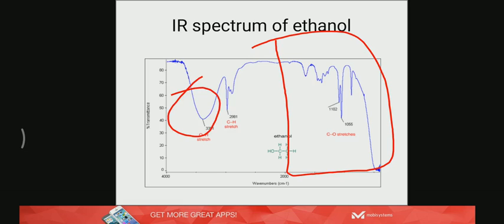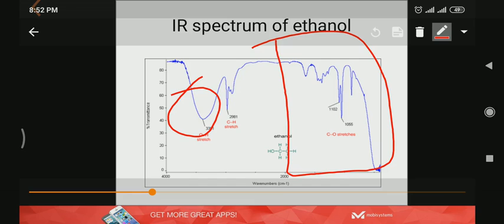So if you take ethanol and methanol and compare, the IR spectra of both molecules will be very similar outside this fingerprint region, but the fingerprint will be very different, or unique. You can easily distinguish ethanol and methanol by looking at the fingerprint region. That is why it is called the fingerprint region.